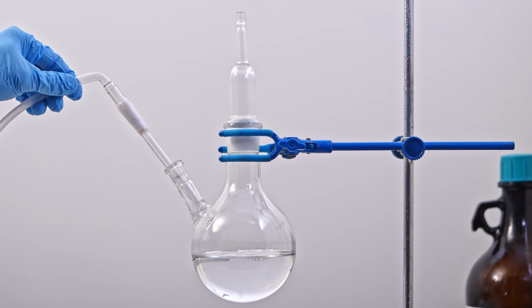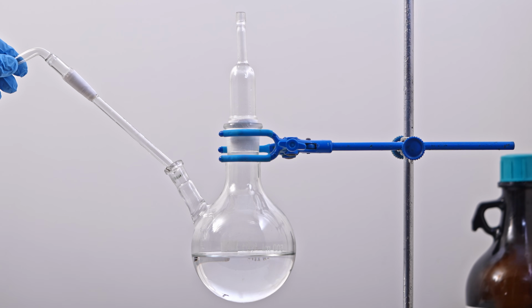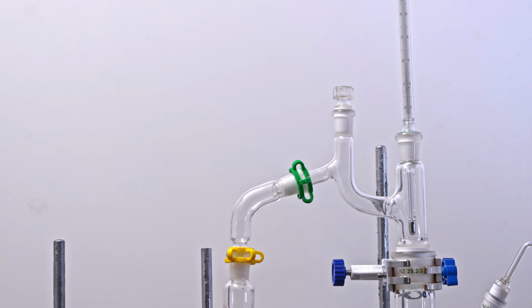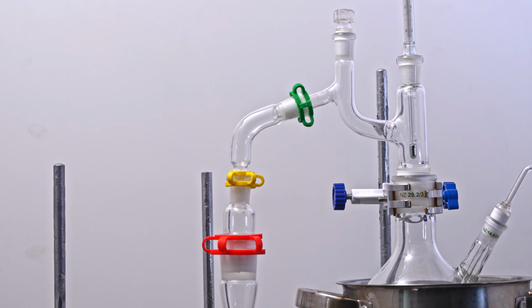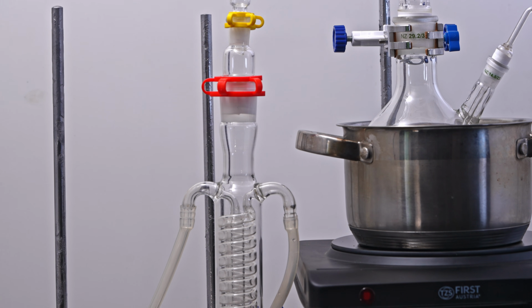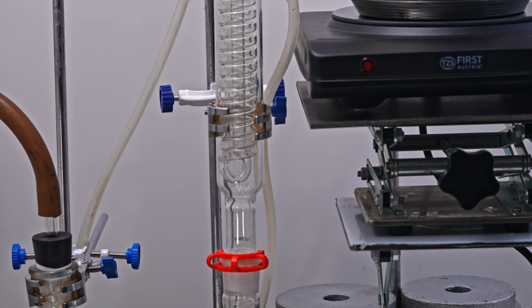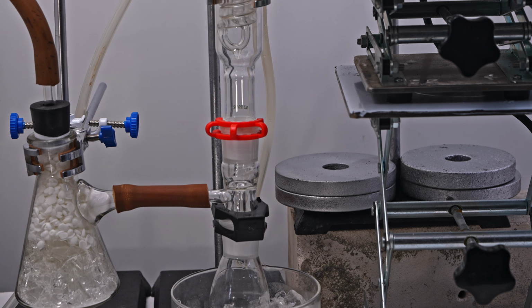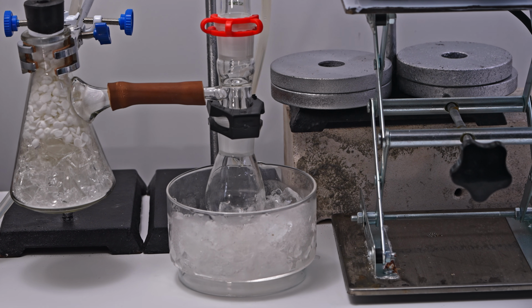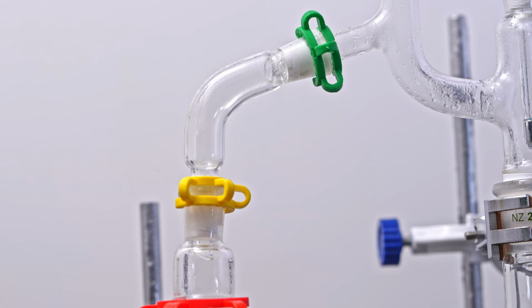After that, we need to do vacuum distillation in order to obtain nitric acid with a concentration as close to 100% as we can. To do this, I put together the setup you can see on the screen. It's a regular vacuum distillation apparatus with a capillary tube connected to a reflux condenser where the anhydrous nitric acid vapors will condense. And on the left there is a safety flask with wet alkali to protect the vacuum pump from acid vapors. Under this vacuum, nitric acid is able to distill even at room temperature.